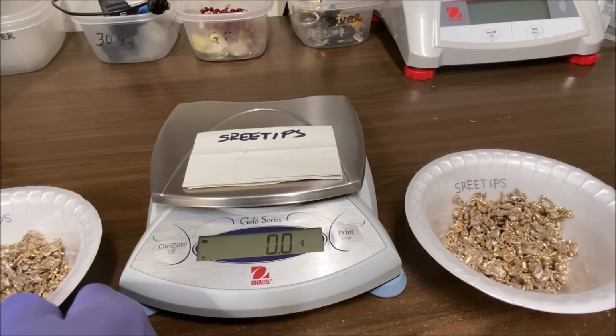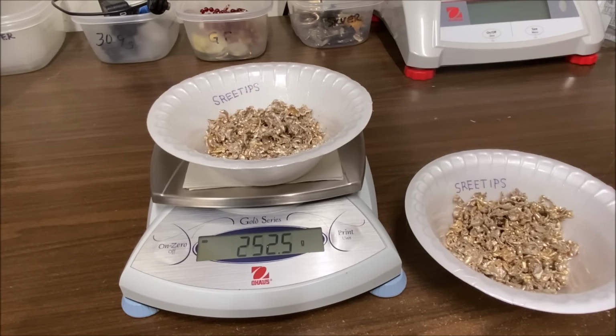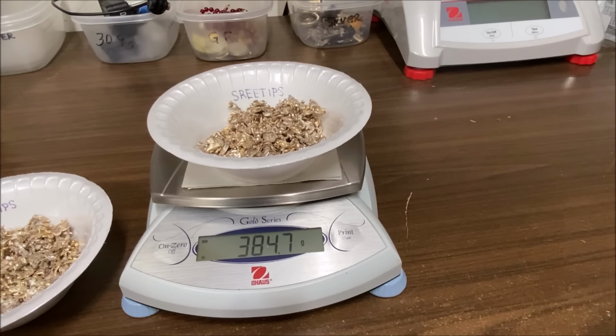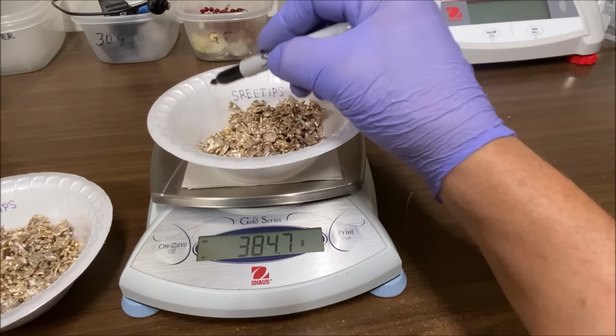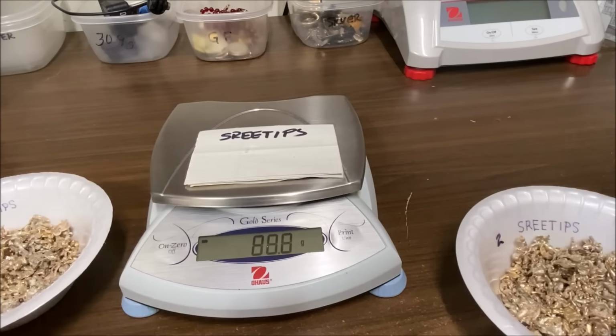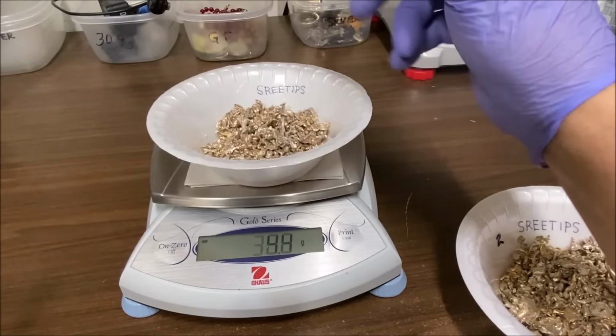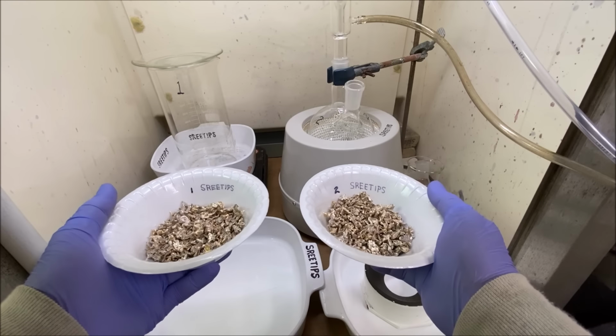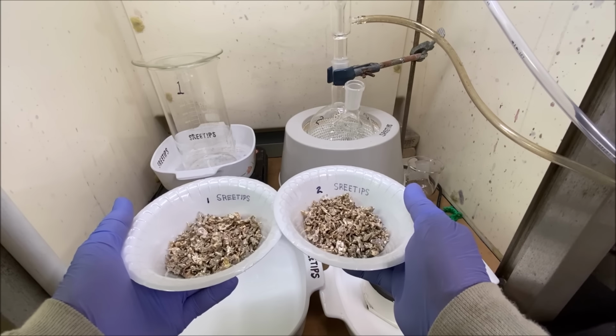I've got these split up now. That's 384.7. And this one is 384.6. That'll be close enough. We're gonna call this one number 2. And we'll call this one over here number 1. Here's our two measures of inquarted gold.